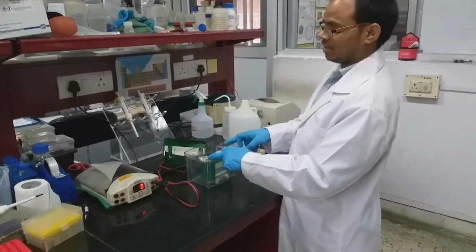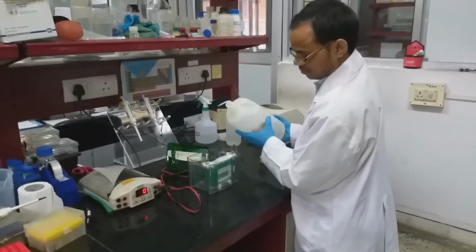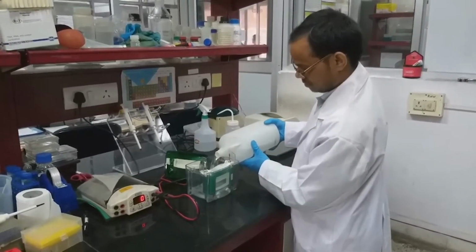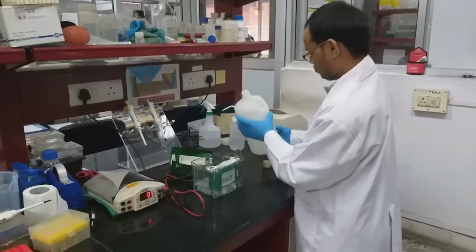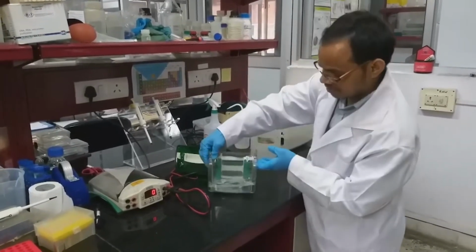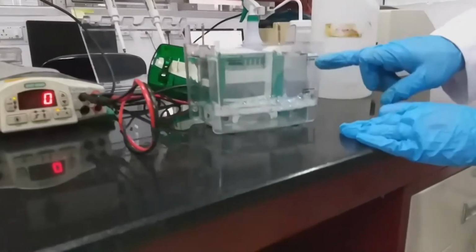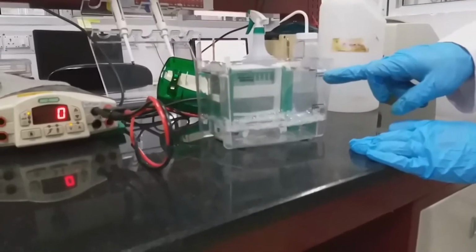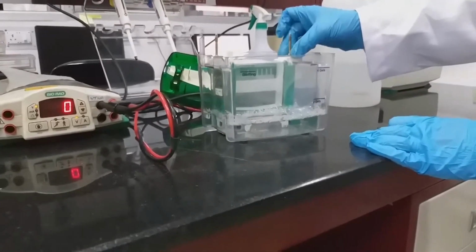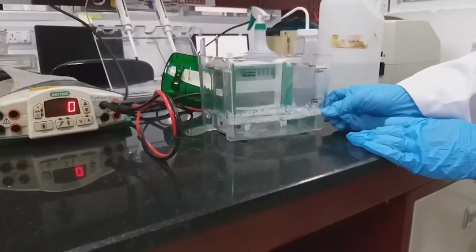We added in this tank, but the main tank surrounding this one, we have to add up to the mark. So for reference, you can see here, for 4 gels we have to add the buffer till here, we have to load outside this gel. So for 2 gels here, for 1 gel we can add like this.